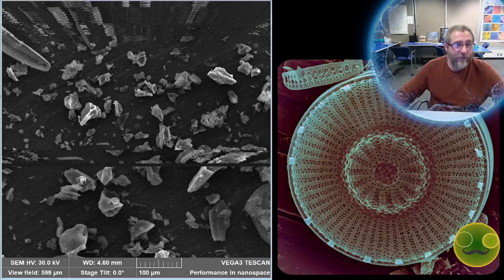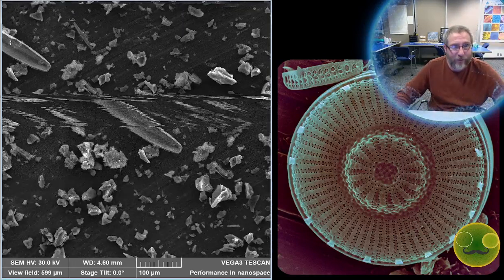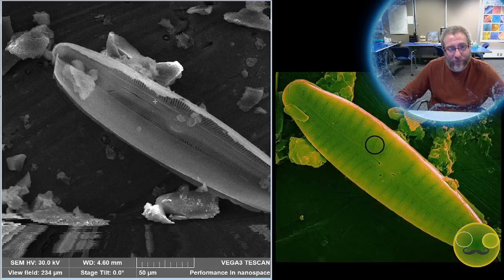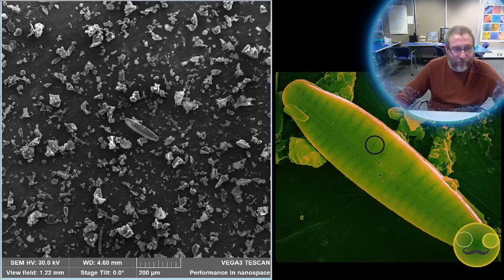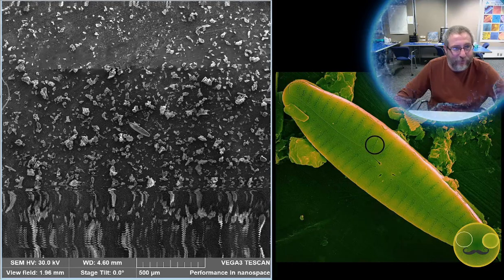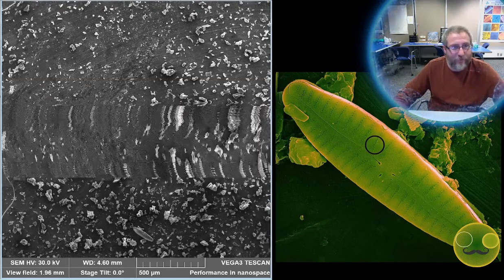So that's a long way of saying basically that probably this environment that these diatoms were captured in, that they were living in, had low nitrogen. And as a result, we have this diatom that doesn't care about the fact that it has low nitrogen, that can live there and do quite well because it has a passenger, basically, that will feed it food. It sounds like a pretty good deal, you know.